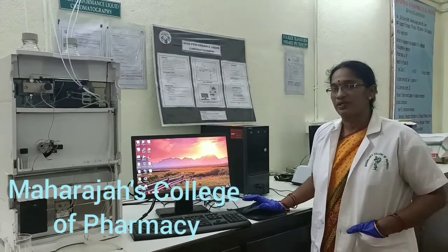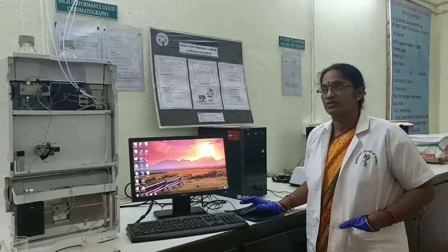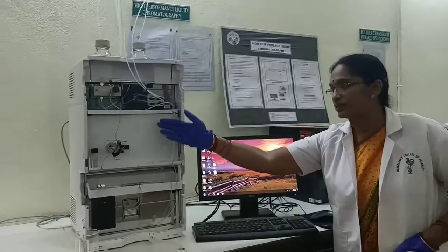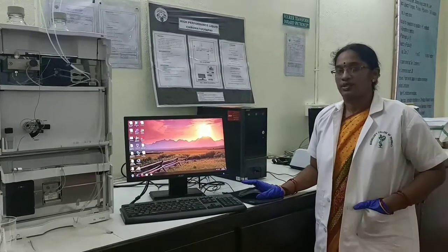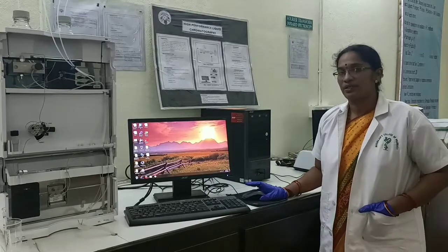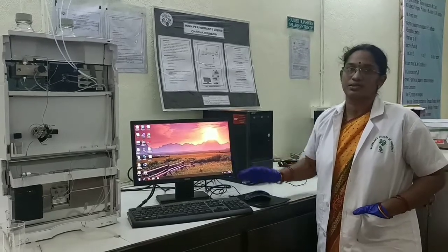In my previous video, I have described how the HPLC separations take place, what are the different parts of an HPLC system, and the different working of all the parts of the HPLC system. In this particular video today, I am going to describe how to inject a sample and how to analyze a drug sample by using the OpenLab software that is installed, based on which the HPLC system works.